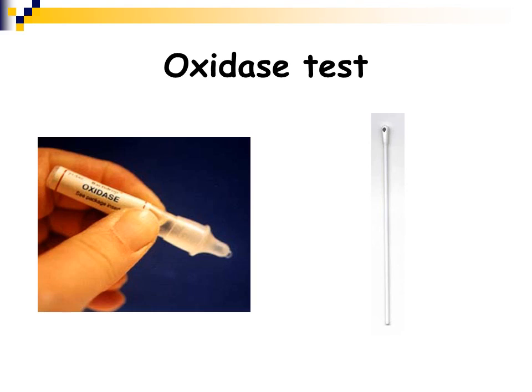So the oxidase test, it's a little dropper, this little oxidase dropper, and you can do this test many different ways. You can pick up your organism using a sterile swab and then drop the oxidase reagent on it, and it'll turn a bright bluish purple, dark purple color if it's positive. Some labs have an oxidase reagent, and you just swipe your organism onto filter paper, you drop your oxidase reagent on it, and when you get that dark blue purple color, you know it's oxidase positive.